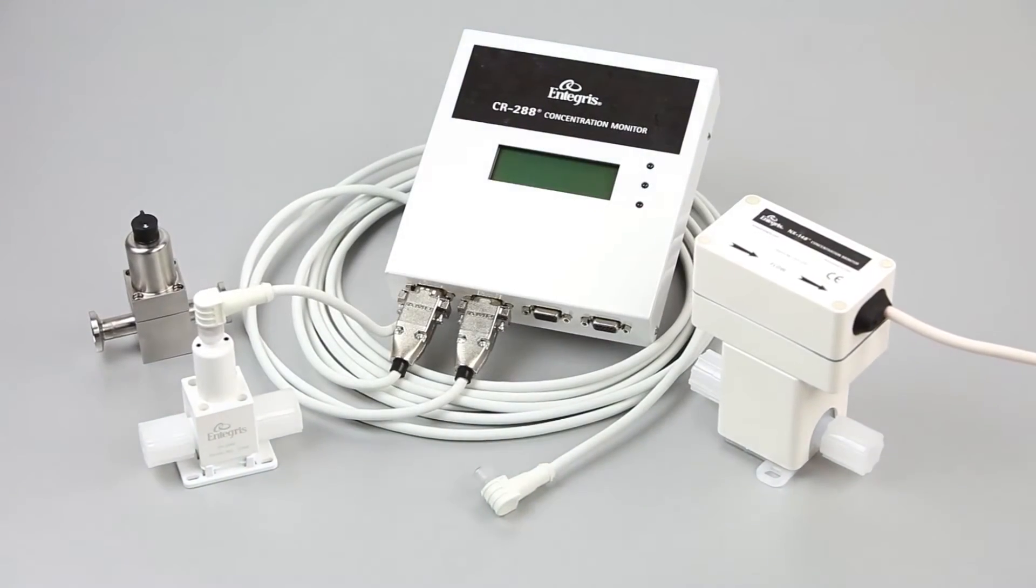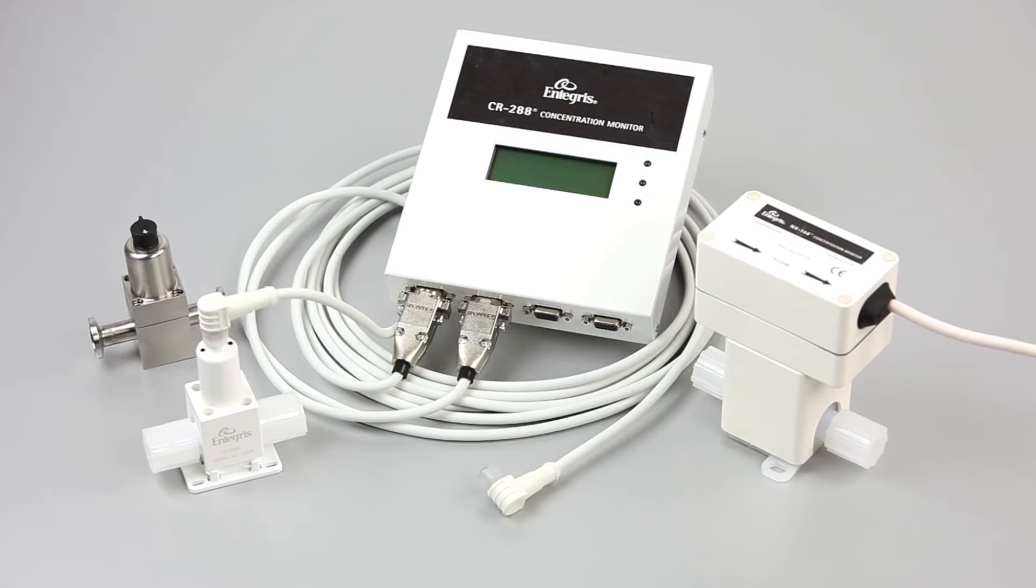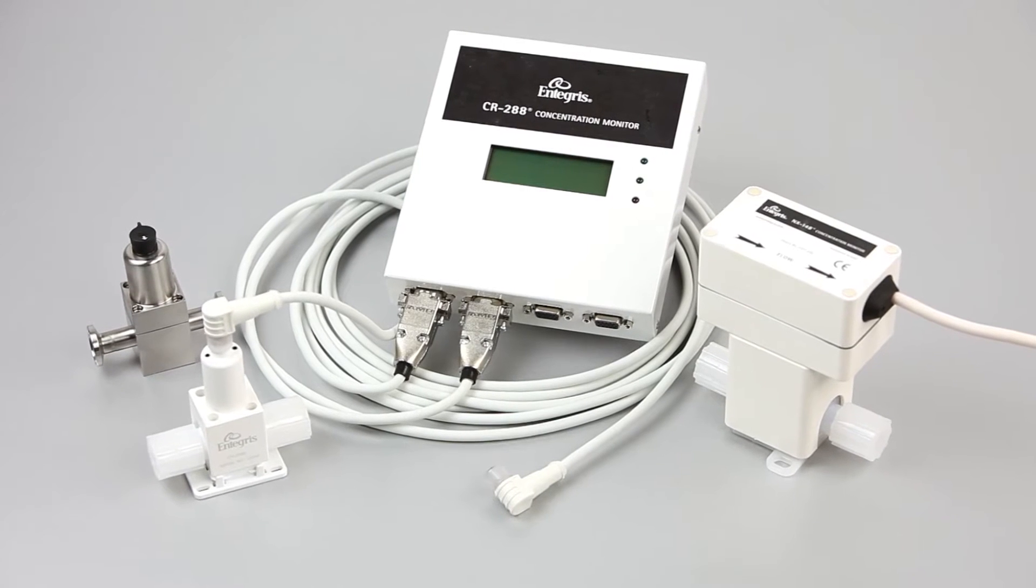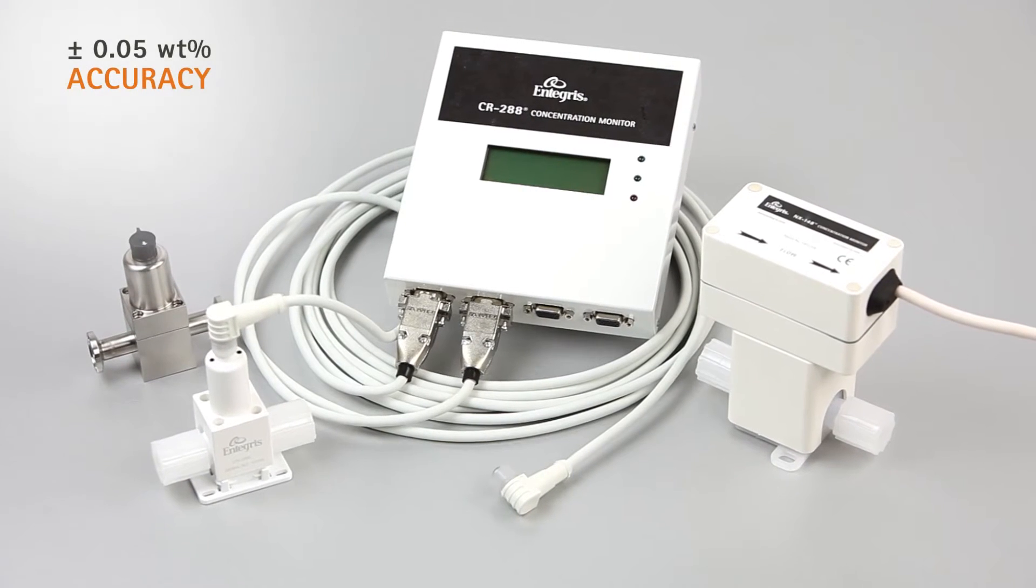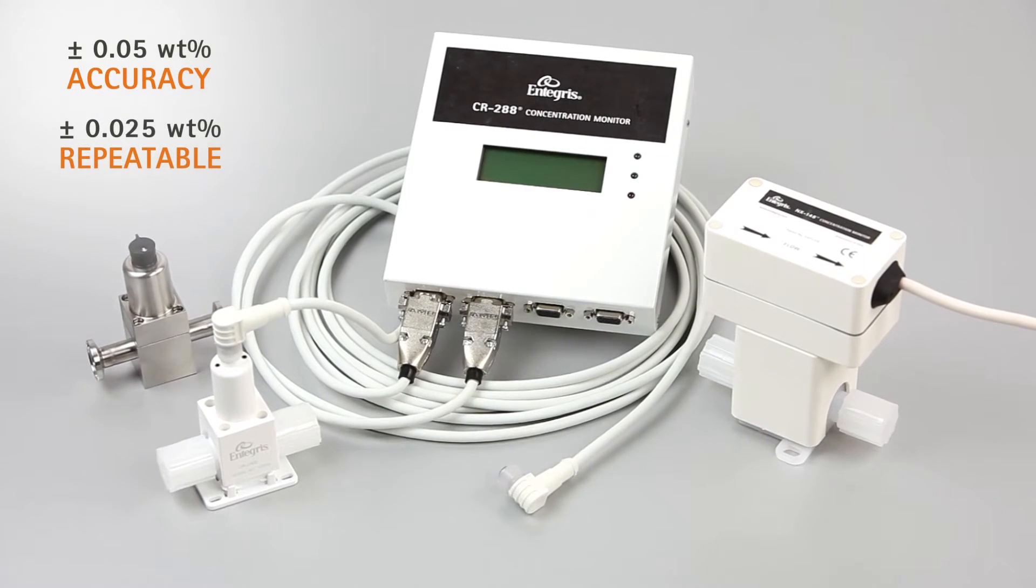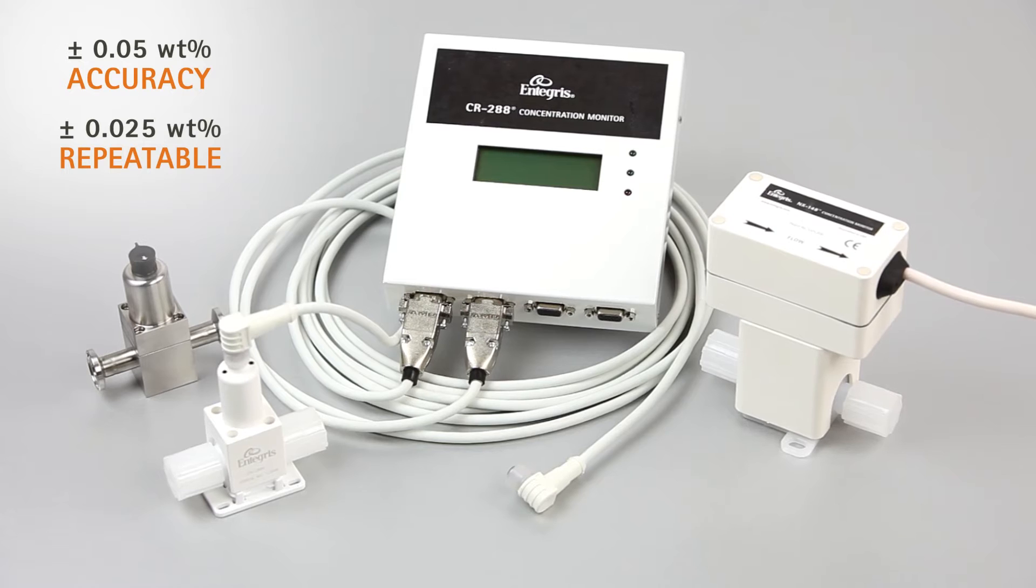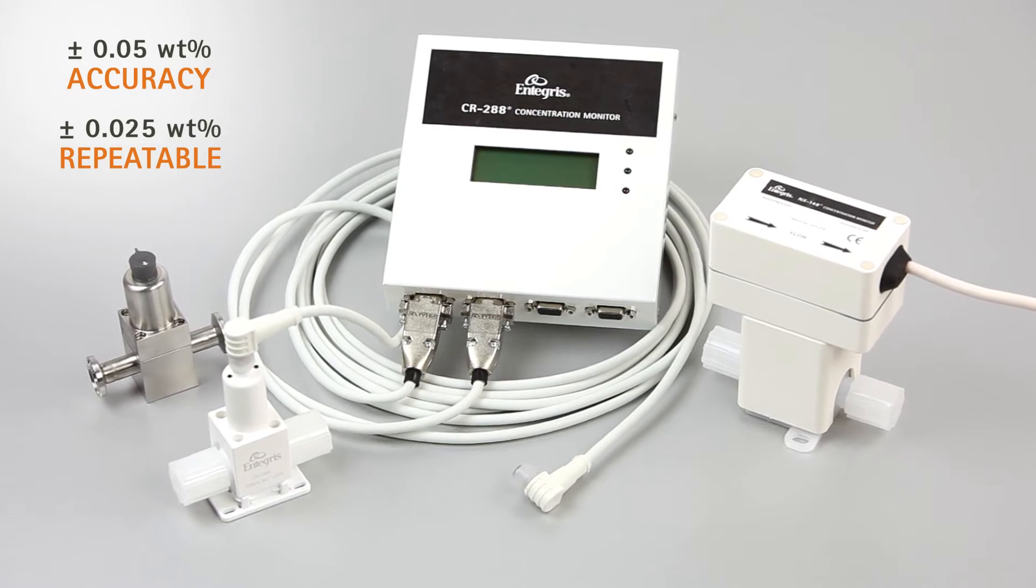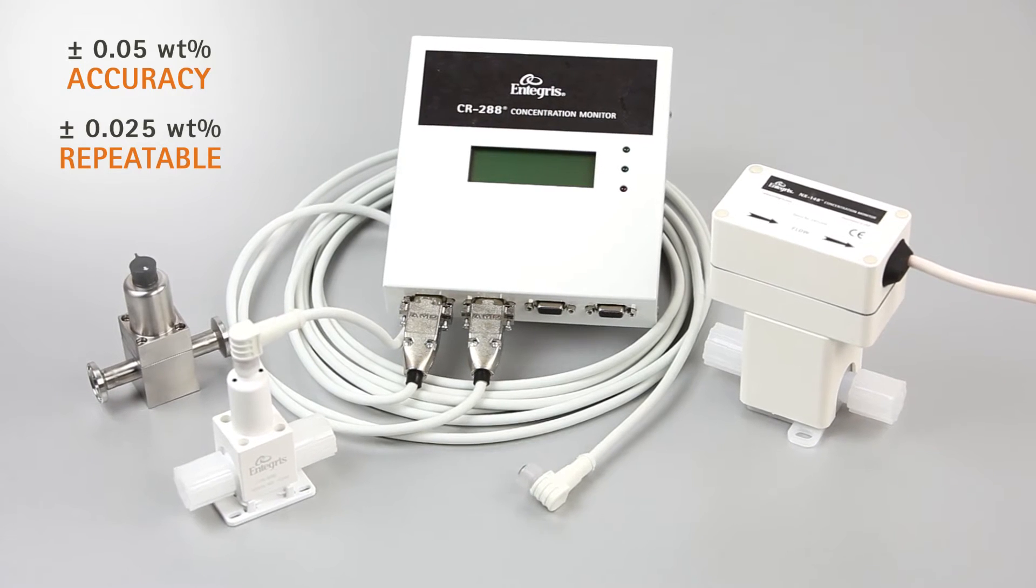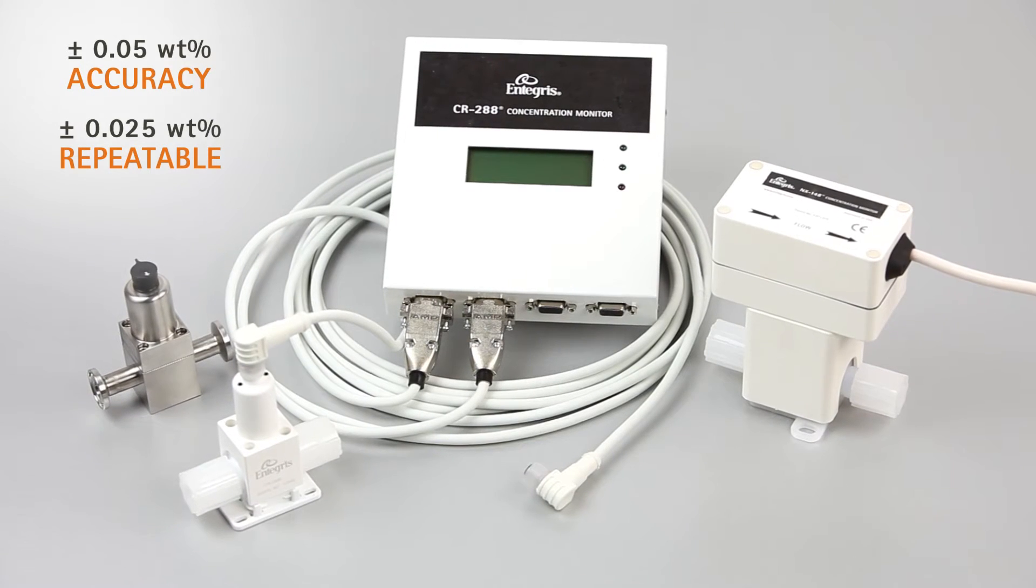With the Integris Index of Refraction monitors, you'll experience increased measurement assurance with higher accuracy, repeatability, and faster response times.